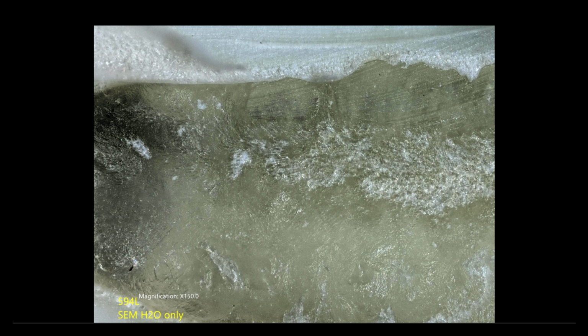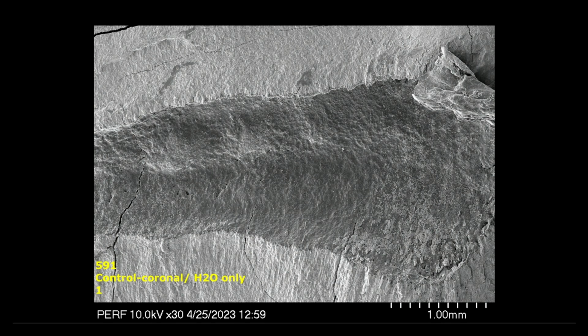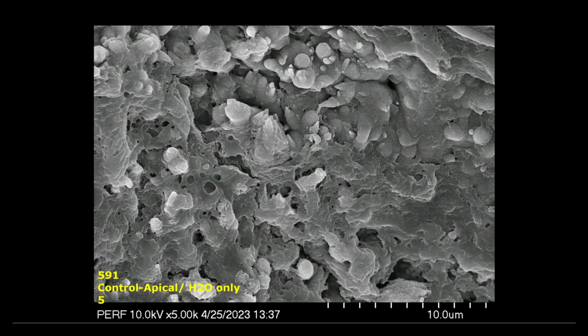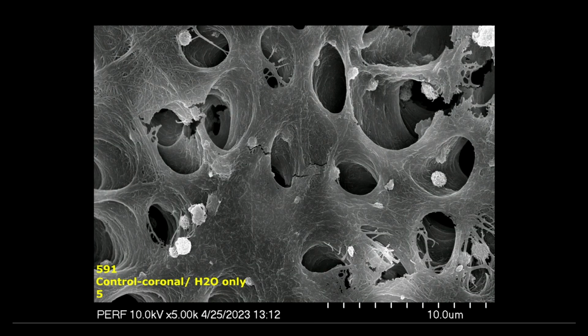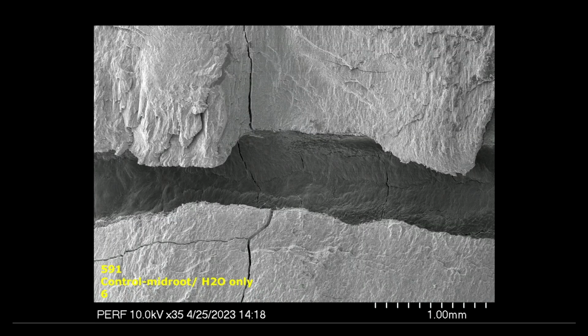We did take some high resolution photographs so that we'll eventually compare these to the SEM images. And then we did this with water only, water and bleach, and water, bleach, and EDTA, and did imaging on those. And we're going to take those cases individually, one at a time. Next week, we'll do the water only phase. And by the time you're done with those cases, you will have developed some pattern recognition on what is normal and what is in these cases with really no instrumentation at all.